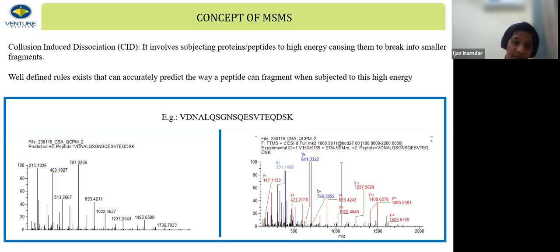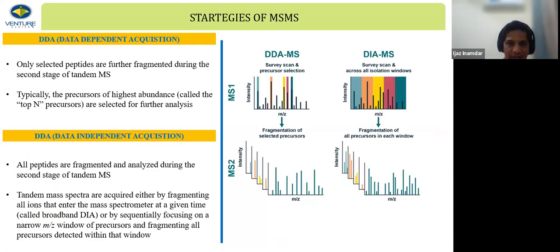So this is a strategy to confirm the identity of the molecule at two stages, at MS level and at MSMS level. And the last thing, now how do you do the MSMS? There are two strategies, again slightly complicated, but when you start doing proteomics, this is very useful. So how do I select the fragment? This also is completely automated. I will tell the equipment, select the top 10 peaks for fragmenting only.